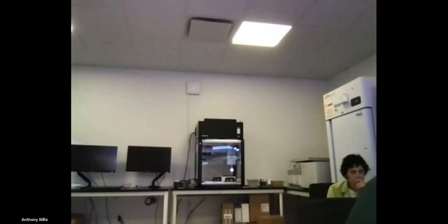You run the automated calibration flow. It's a guided wizard on the touch screen. The pipette will move to the center of one of these plates and, using its capacitive sensor, essentially find the edges of it. We then do a binary search and we teach the robot geometry on its own, which is pretty cool. So again, calibration totally automated. You choose to start it, you pick an instrument, you can do it with the gripper and the pipettes, and it will just go.